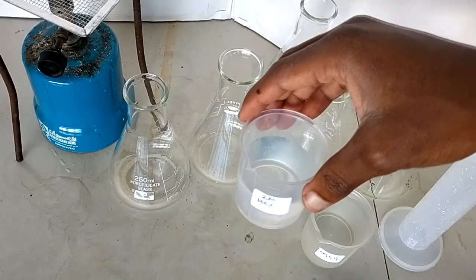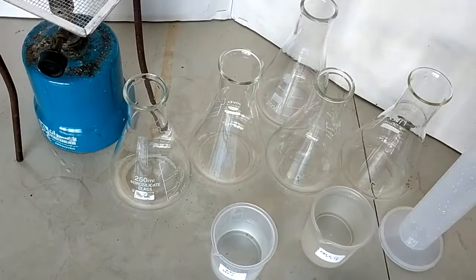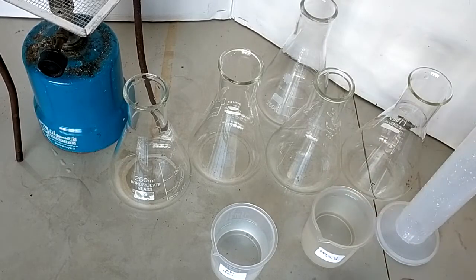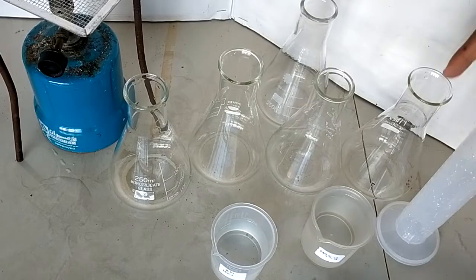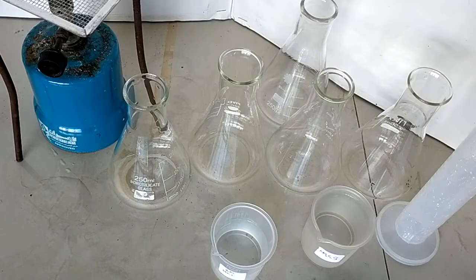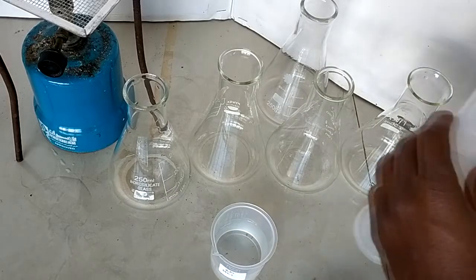So in this one the procedure is simple. You need to measure 30 cubic centimeters of sodium thiosulfate and put it in each of these five conical flasks. So I'm going to do that right away. Measure 30 centimeters cubed.